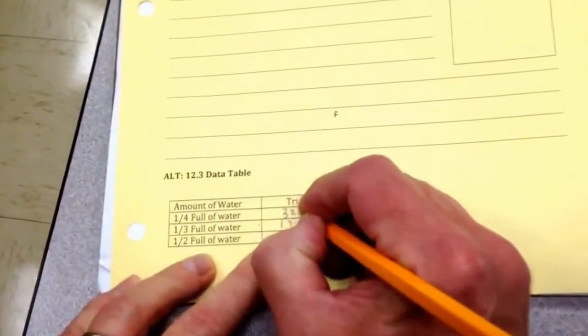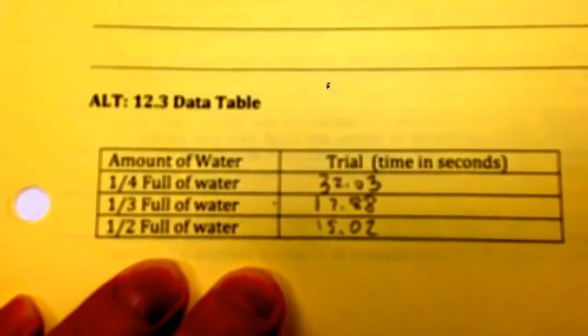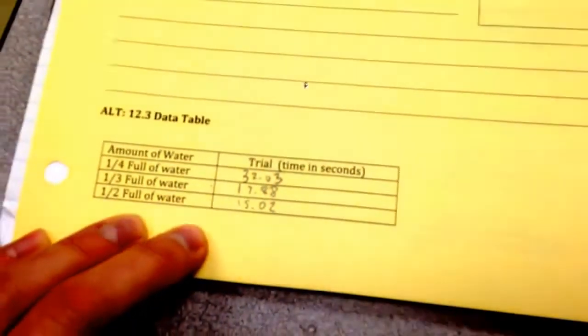So I'm going to put that over here. 32.03. All right. So there's our data. And now let's talk about what our next steps would be.